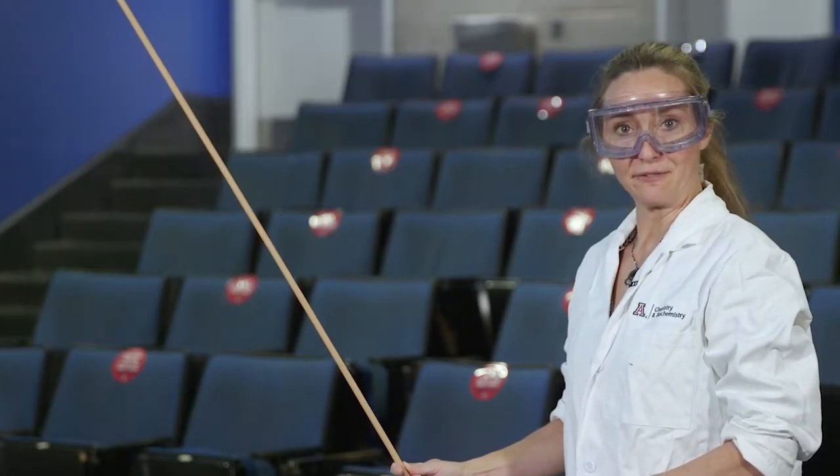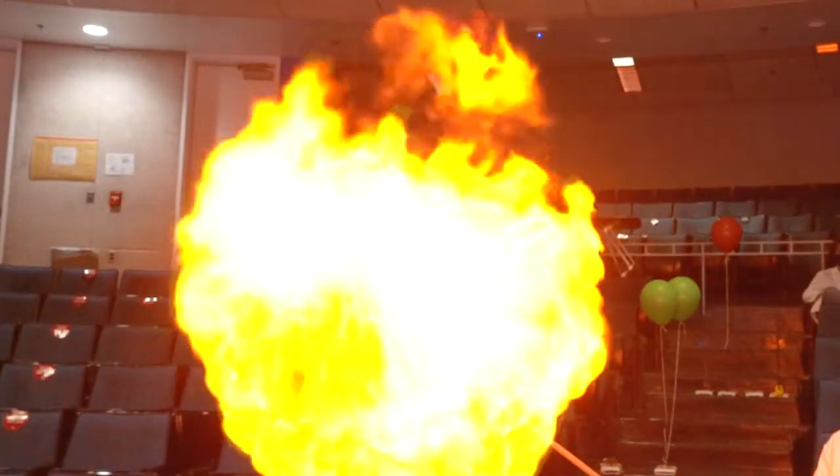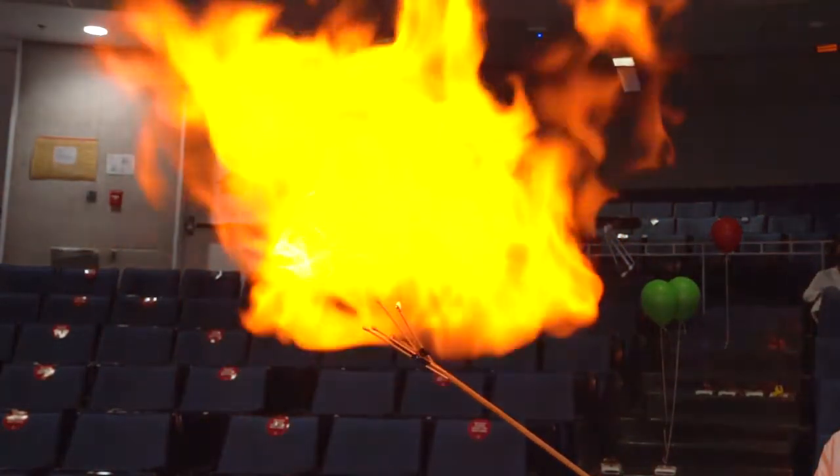Well, that was impressive. So what just happened and why? Well, it turns out that it's the exact same reaction that happened when hydrogen exploded before. Hydrogen was reacting with oxygen in the atmosphere to make that big, beautiful fireball.